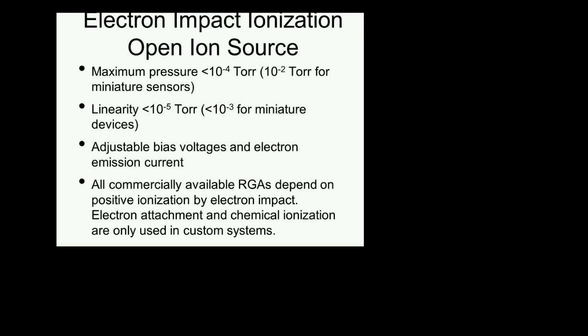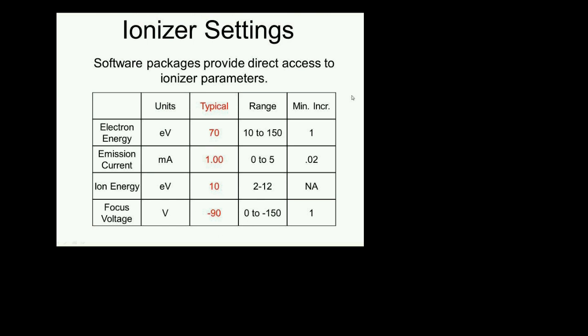Okay? So this is kind of quick and dirty. Unfortunately, this is a condensed class, so we have to go through some of these things fairly quickly, but I'm giving you a taste that there are all these components inside the probe, and even within each one of those components, there are parts that are important, that have parameters that need to be adjusted for different applications. Of course, we're not going to be able to address all of those today.